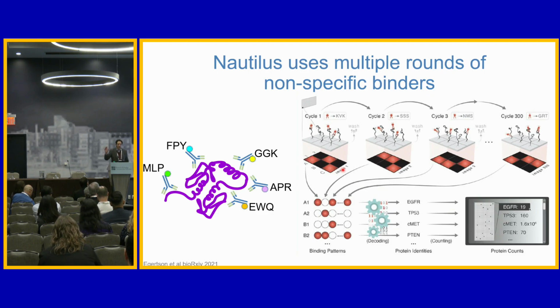But they don't light up literally everything, right? So you want a bad antibody, but not that bad, that it binds to literally everything. So you get a pattern down here. Once you take that pattern, after enough of these bad antibodies pass through, you can use the confluence of that information and pass it into, again, a machine learning algorithm that is going to spit out some information about the actual abundance of those individual proteins. So that is, again, another strategy for trying to deal with this.